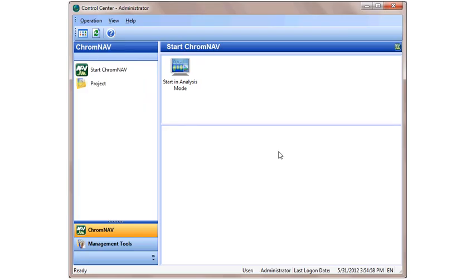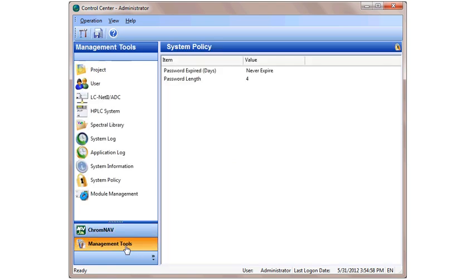After you have logged on as the administrator, you will come to the Control Center window that you see here. To get started, we're going to create a new user. First click on Management Tools and System Policy.